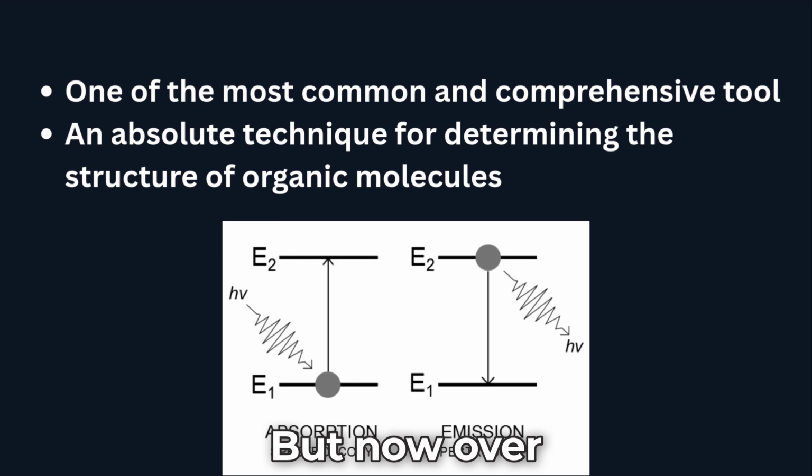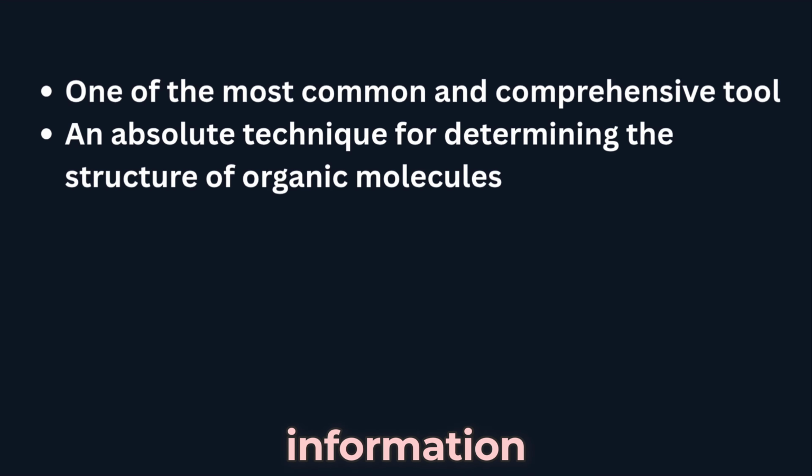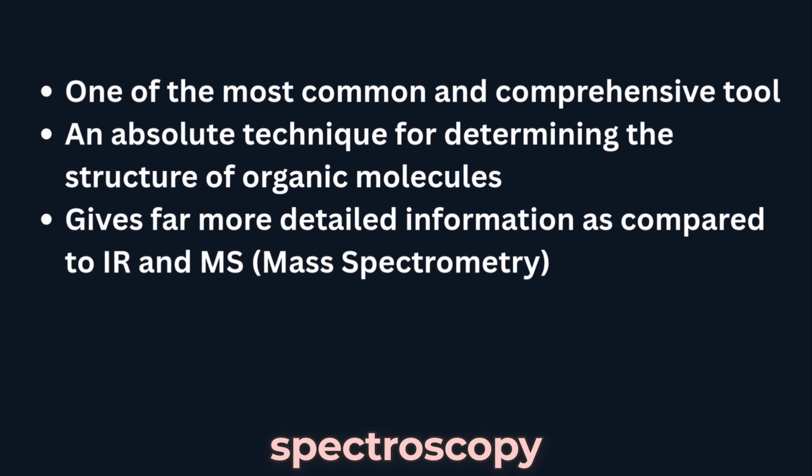But now over here, the interesting part is NMR gives us far more detailed information compared to techniques like IR spectroscopy and mass spectroscopy. Mind it, far more detailed information. Now, don't worry, in this video, we are not going into the complicated physics behind NMR. Instead, we will focus on something much more practical.